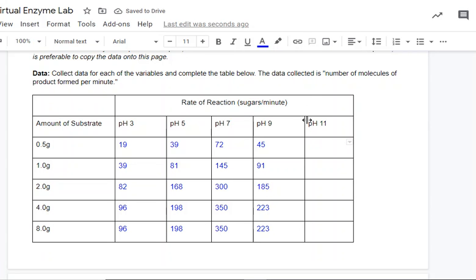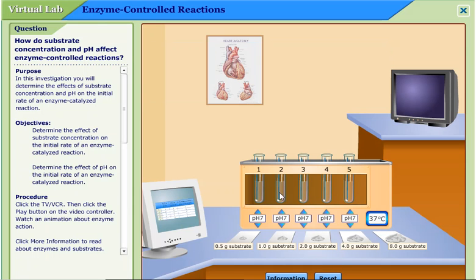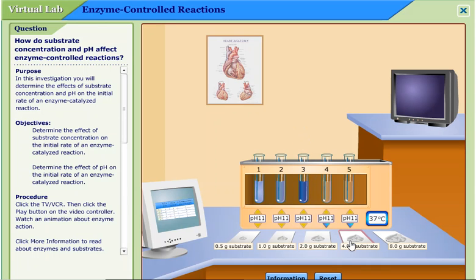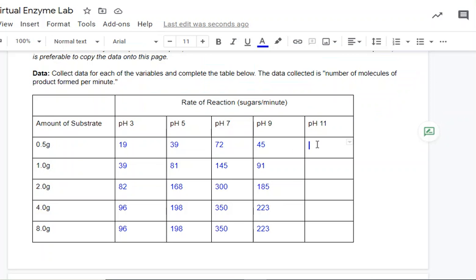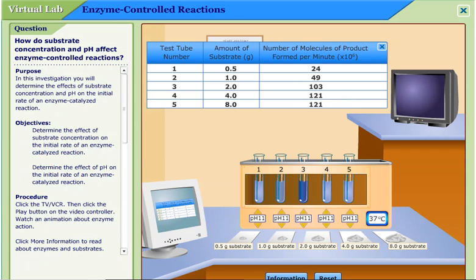Let's see if the same thing happens at pH 11. This is our last pH — the strongest and most alkaline pH we've tested because the number is closest to 14. We have 0.5 grams of substrate in test tube one, 1.0 gram in test tube two, 2.0 grams in test tube three, 4.0 grams in test tube four, and 8.0 grams in test tube five. Still at 37 degrees Celsius. The numbers go down: 24, 49, 103, 121 and 121.